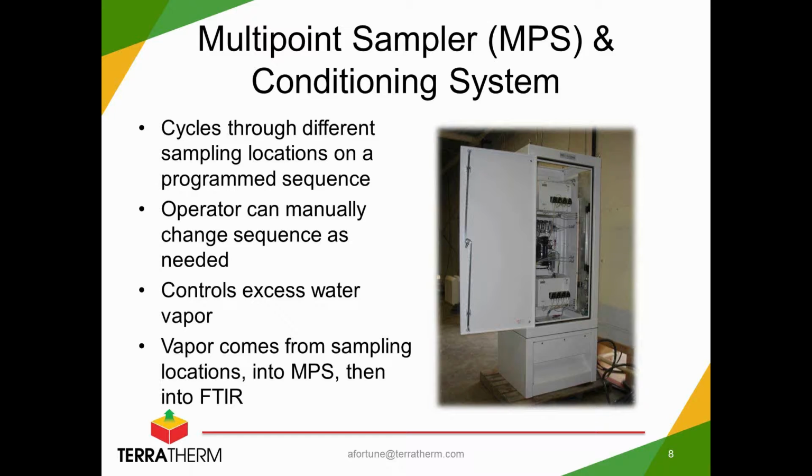FTIR instruments are routinely used in other industries, such as industrial processes or chemical manufacturing, things where there's a set process where we need to have quality control or real-time monitoring of a smokestack, that sort of application. To our knowledge, this is really the first implementation of a system like this for a short duration remediation system like ours.